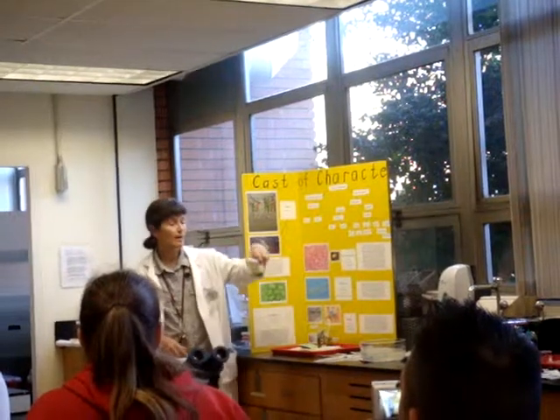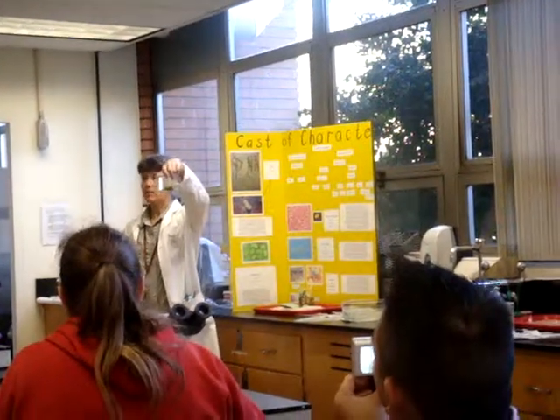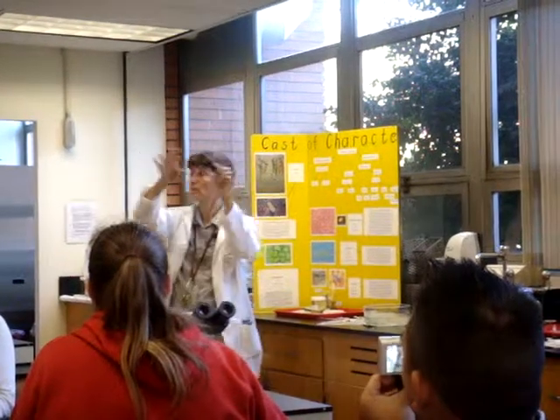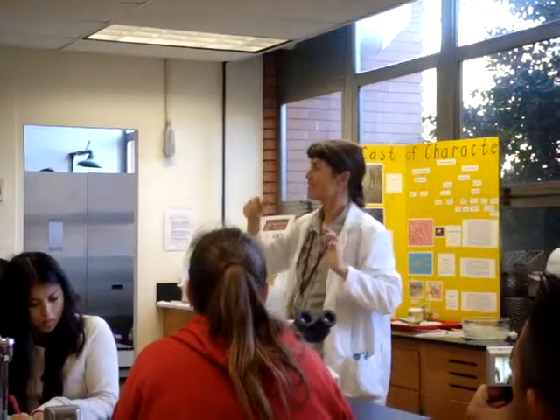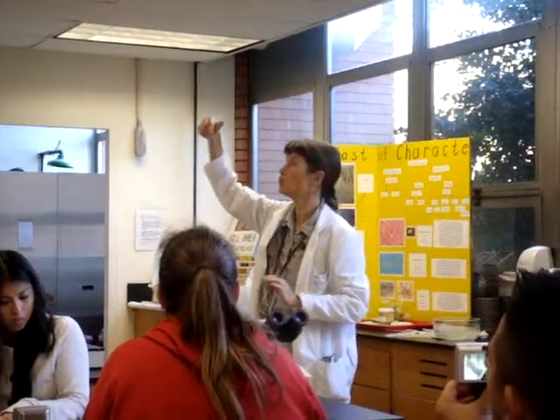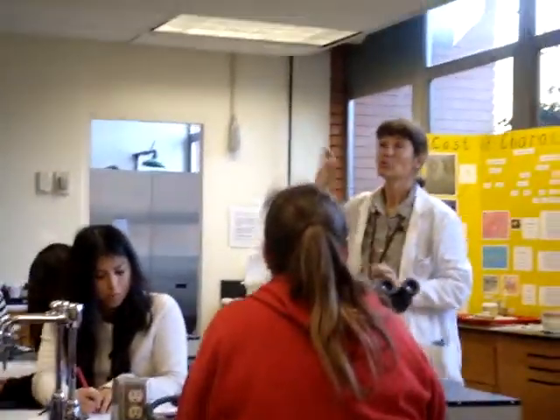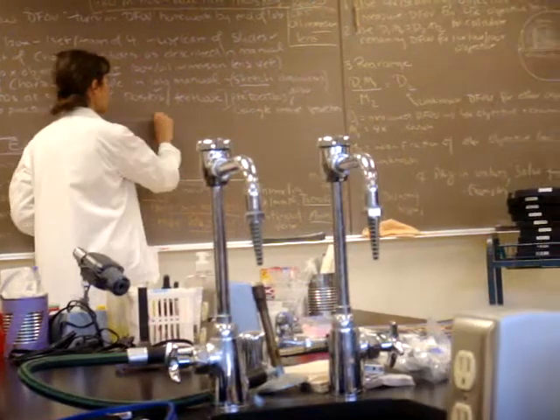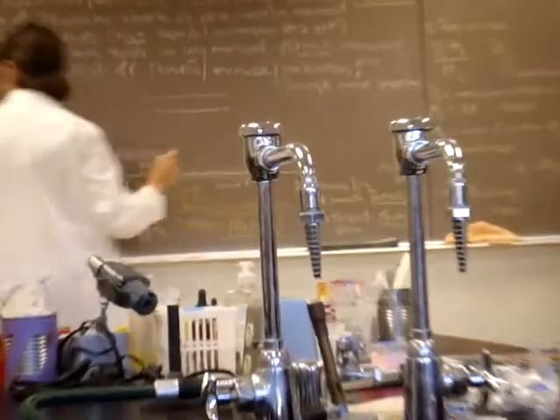So you're going to make a wet mount of Spirogyra and take a look at these beautiful algae. They too are going to form beautiful filaments, chains of cells. And what's going to knock your eyes out, you guys, Spirogyra has this beautiful green helical or spiral chloroplast. And what's cool, yesterday we were noticing the size of the spiral chloroplast in Spirogyra. They're much bigger than the cyanobacteria here.